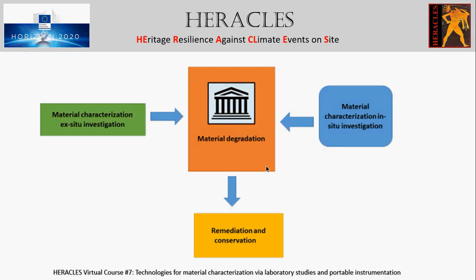All phases prior to the analytical steps are important, including sampling, which has to be carefully planned and representative. Sampling is indeed a very important procedure and often constrains the analytical stage. So it should be accurately described and samples have to be stored properly. Sample preparation can vary depending on the test to be performed and on the characteristics of the material itself.